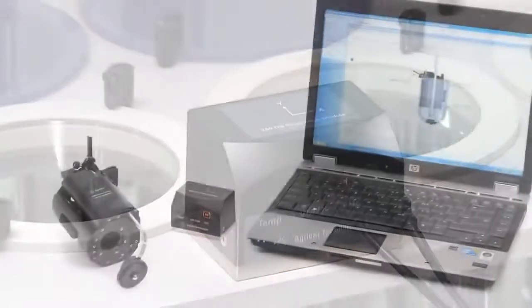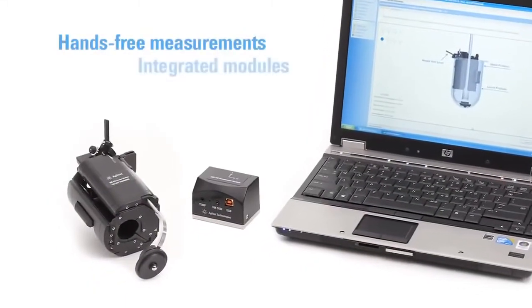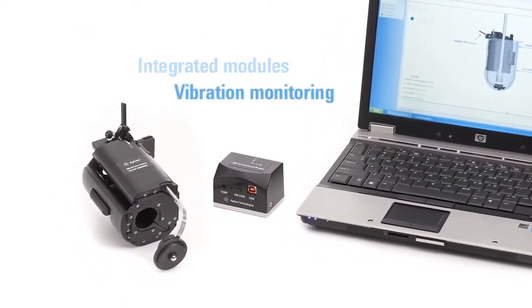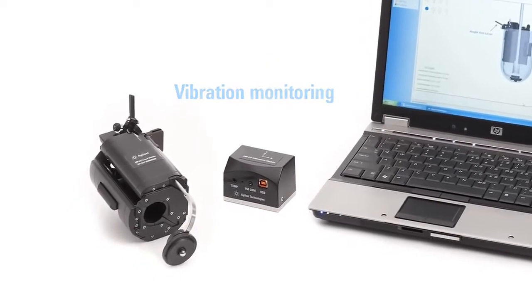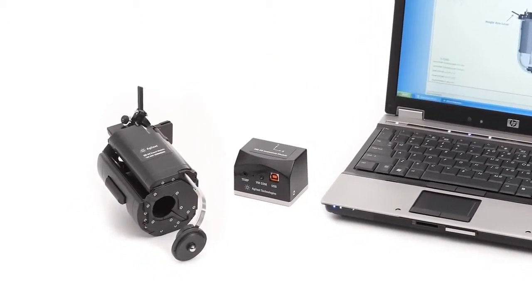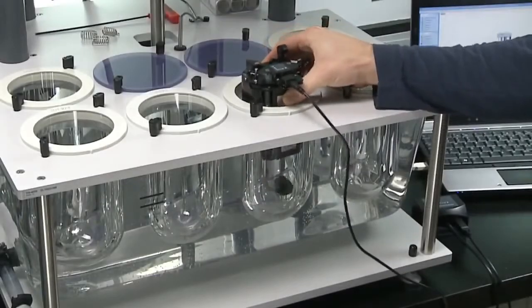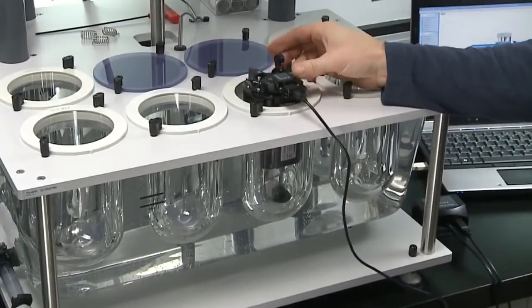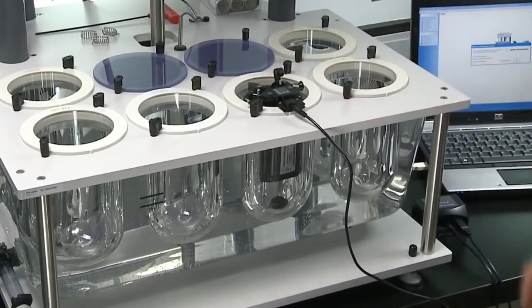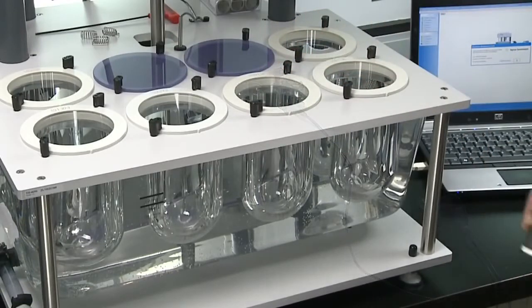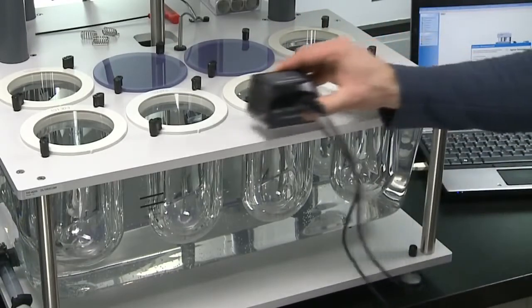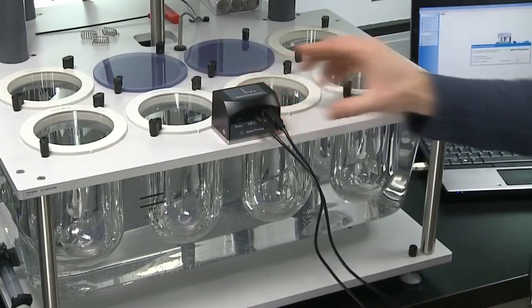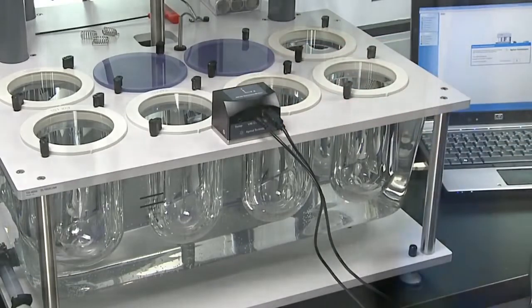The 280DS takes MQ measurements using the vessel and instrument modules. Once the modules are positioned, all measurements can be taken without the use of separate tools or added steps that increase time in the qualification process.